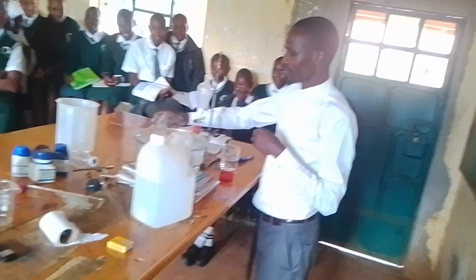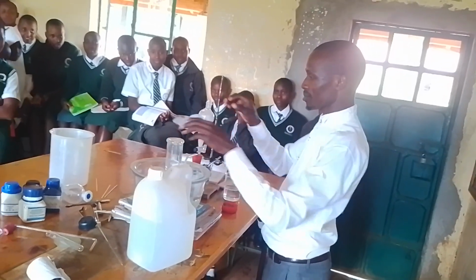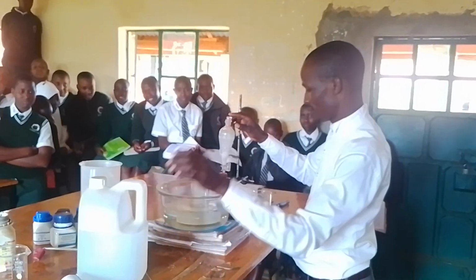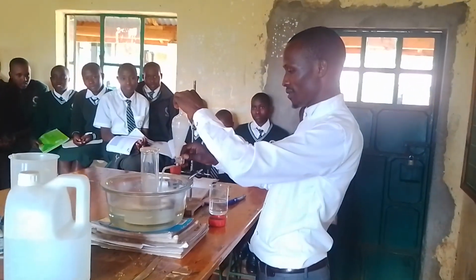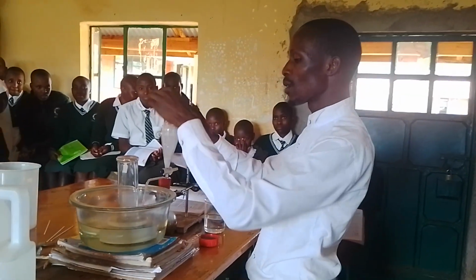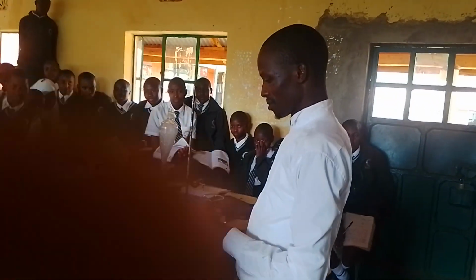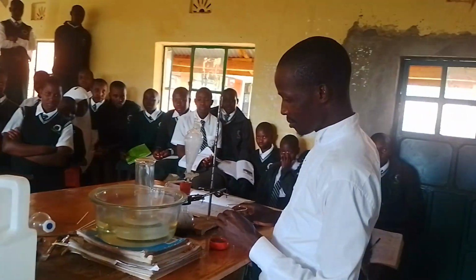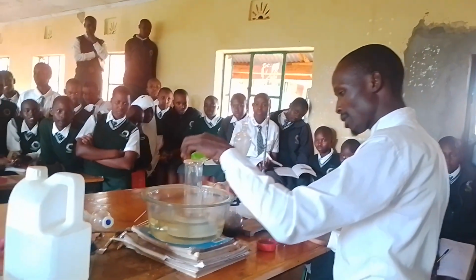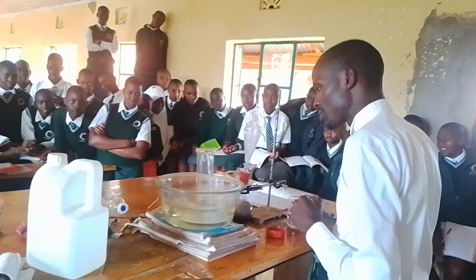What is happening? That is how seriously oxygen is coming. Are you seeing that reaction? That is how oxygen comes out seriously. And you will see bubbles, eh? Yes. Bubbles coming out, and you can see a gas which is being collected, a colorless gas.